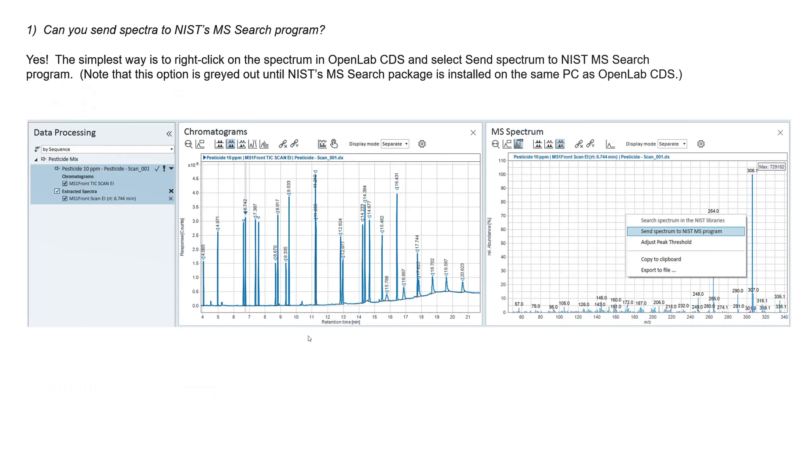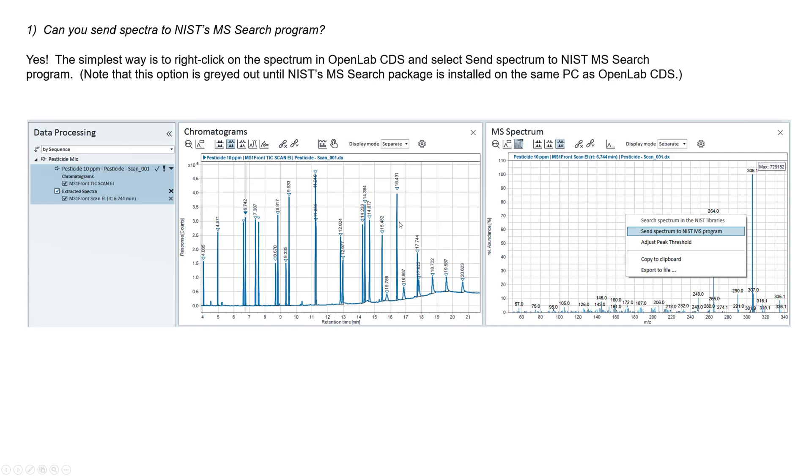The first one is, can you send Spectrum to the NIST MS search program, much like you can in MassHunter and Chemstation? Yes. All you have to do is get the Spectrum up, and of course you got to have the NIST MS search license and the software installed on your computer. This is grayed out until the NIST MS search package is installed on the same PC as OpenLabs. Then after you do that, you just go and right-click on the Spectrum and say, send Spectrum to NIST MS search. As easy as that.